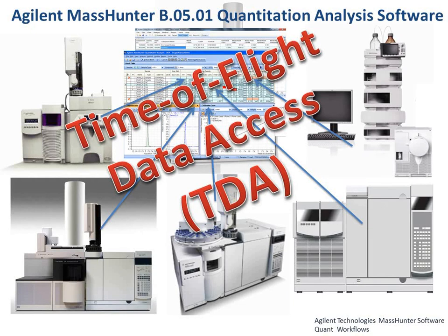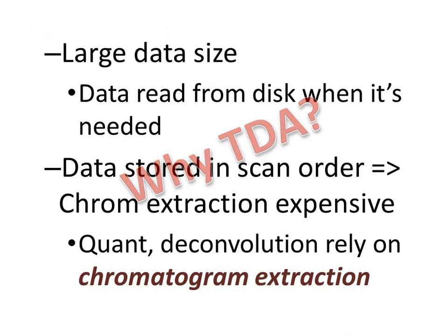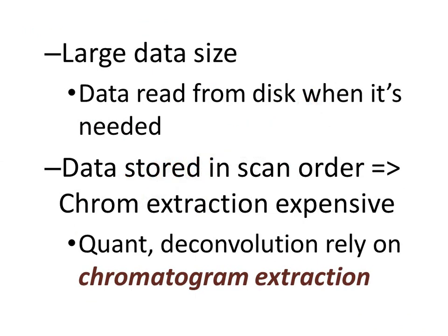Let's talk about a time-of-flight data access layer, TDA. And from the end user's point of view, the upshot here is, well, speed. So first, we have large data sizes. And even with centroided data, the data needs to be read from the disk when it's needed.